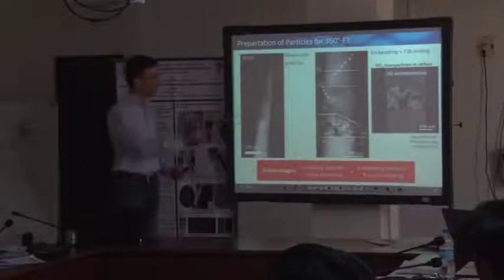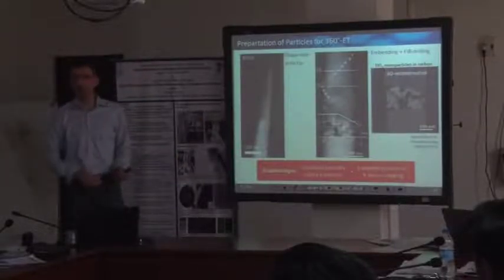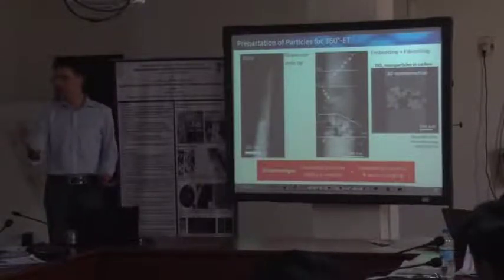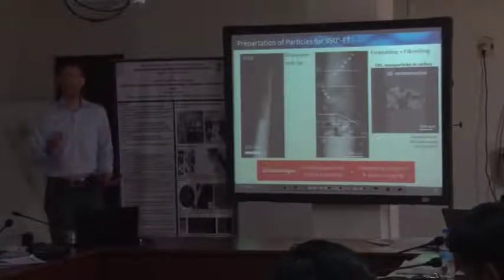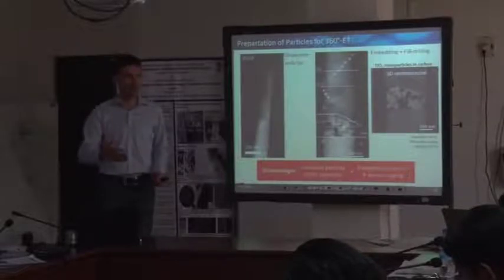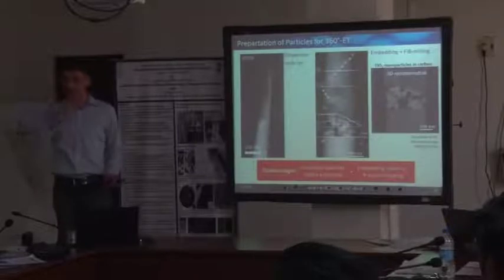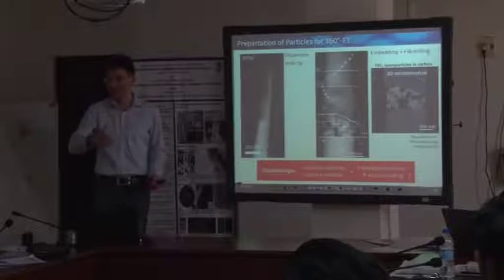We have this tip, let's say, for 360-degree tomography. For conventional tomography, you might just simply disperse the nanoparticles onto a TEM support film. This is how you do that. And you hope that those particles don't move while you record the tilt series. Why would they move? They wouldn't move due to gravity, they stick to the support film, and as you tilt to large angles, they wouldn't drift, so this is not a big deal.